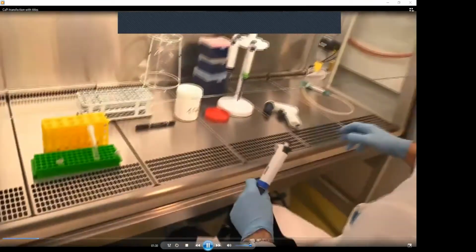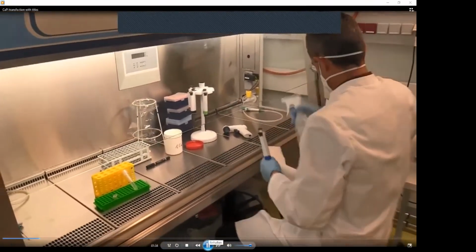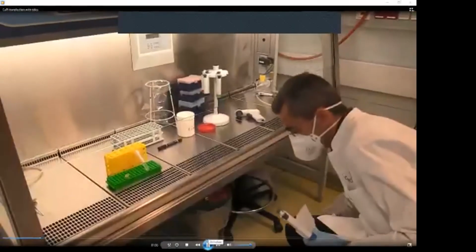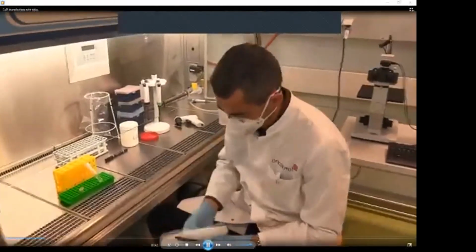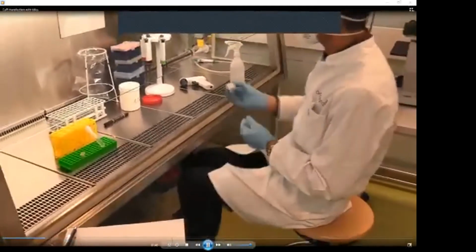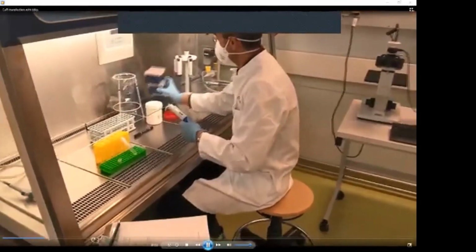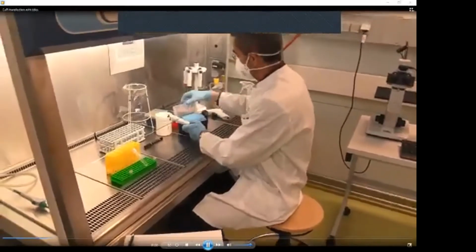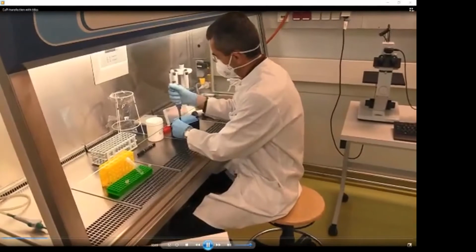So 520 microliters. Then one technical detail: always when you work with tissue culture and these pipettes, you have to clean them with 70% ethanol, this lower part of the pipettes, because although you are using autoclaved tips, it can happen that you touch something with the pipette itself, and that leads to contamination of the sample. So don't forget to do it always. Always clean the pipette with ethanol.